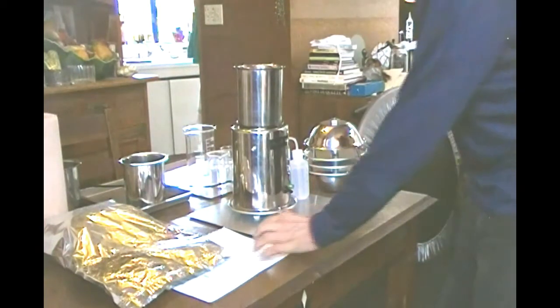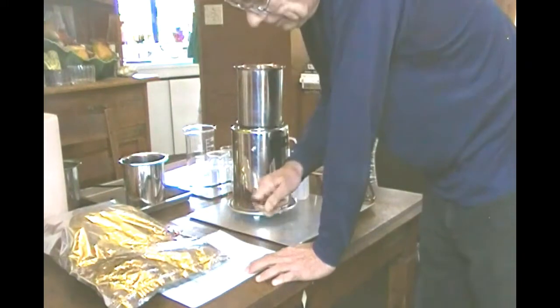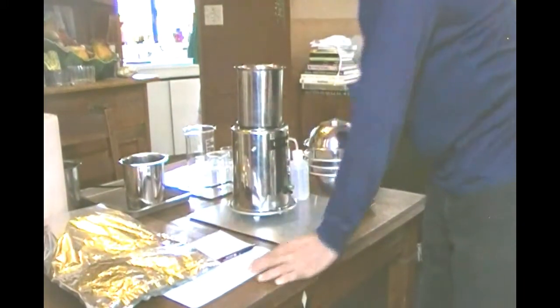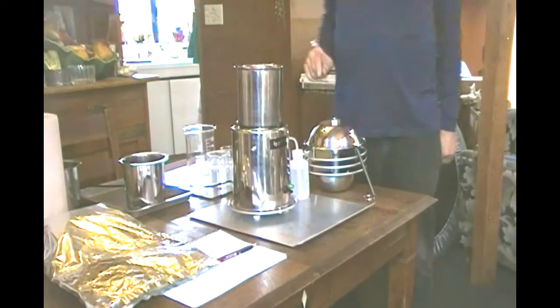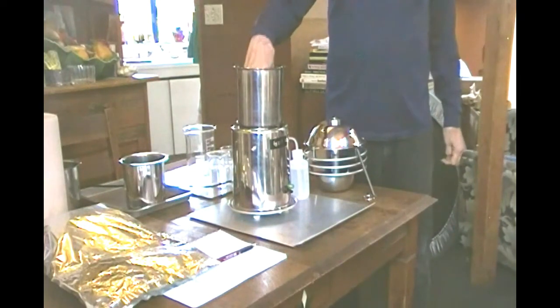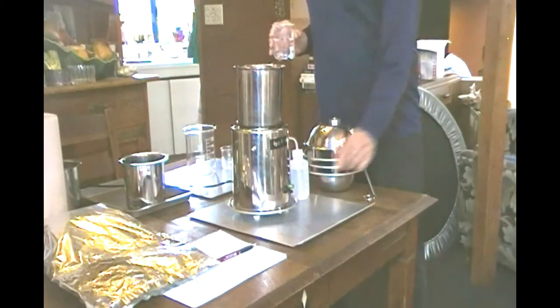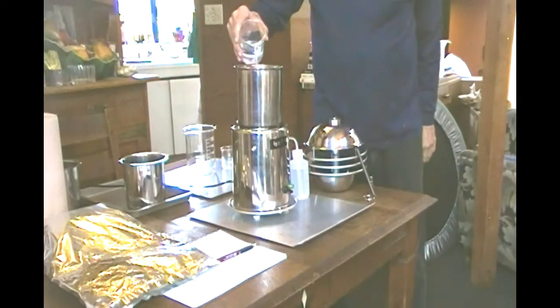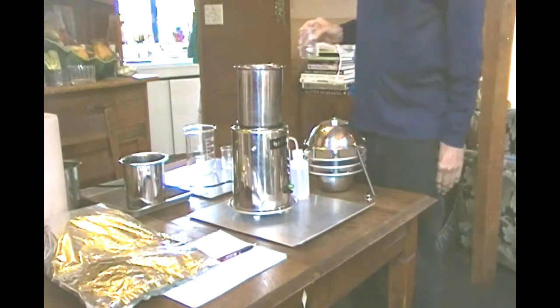We're putting 200 milliliters of ethanol into the processing vessel. Now what we want to do, we want to add the ethanol so that it saturates the hops and it fills the processing vessel underneath the extraction basket to between 1/2 inch and 1 inch. So making sure this is off, making sure it's unplugged, we're going to pour it right down, saturating everything. And there's our 200 milliliters in there.